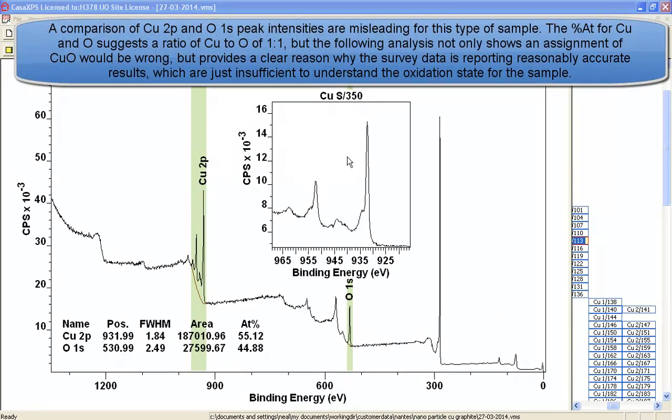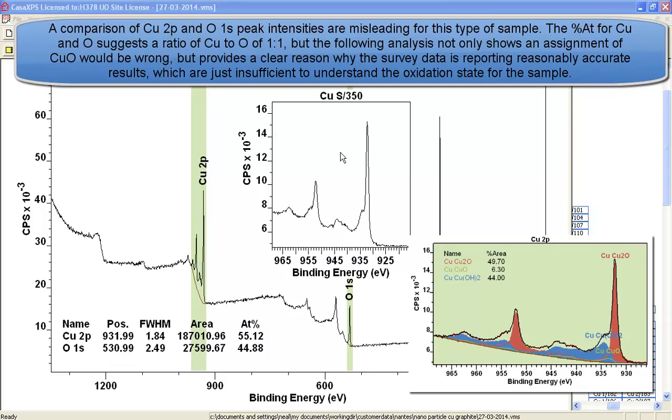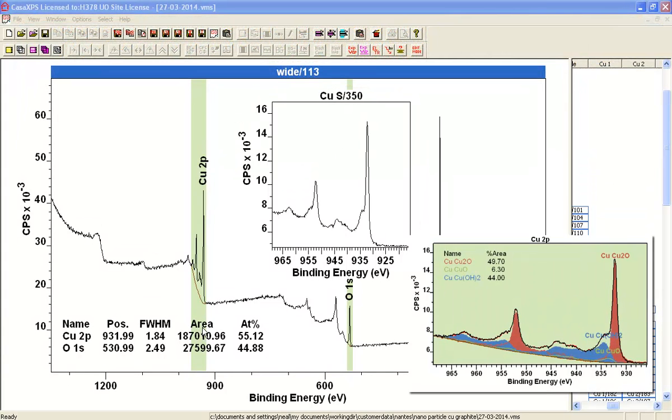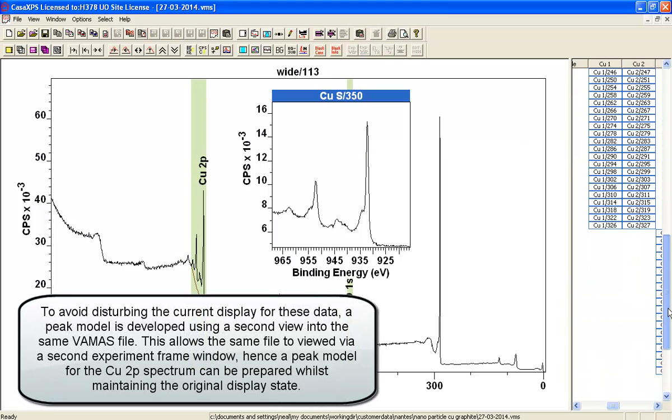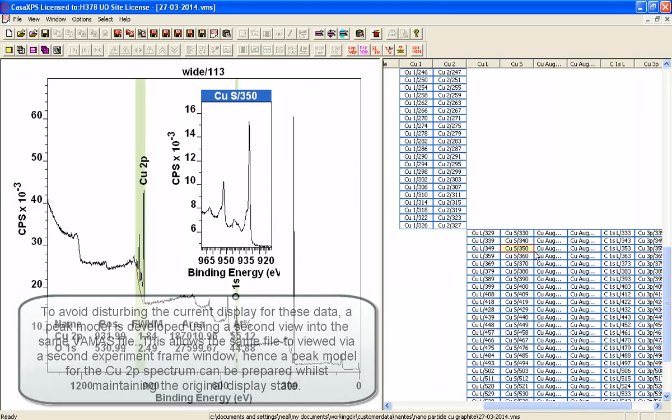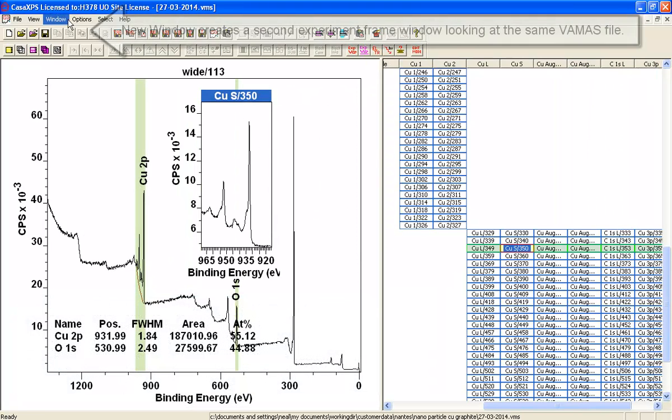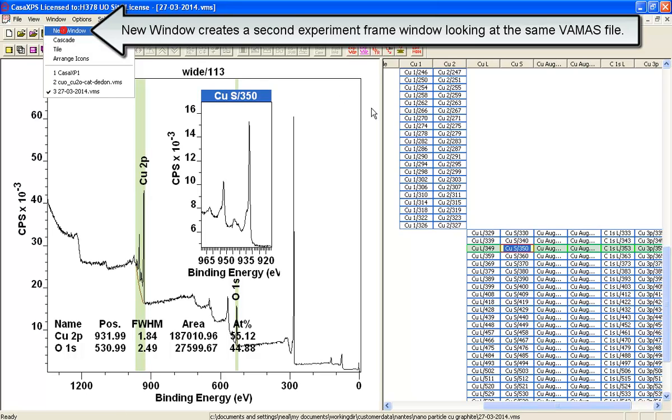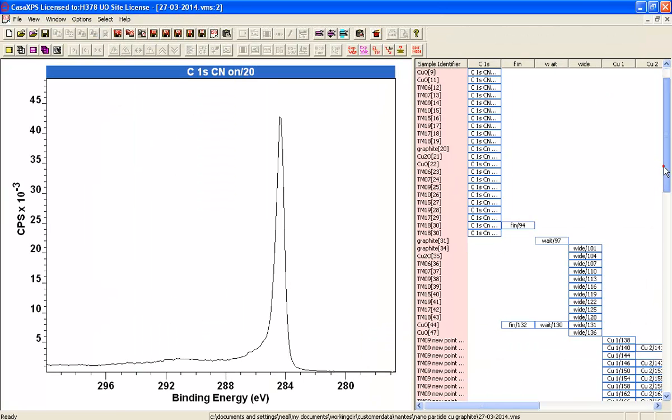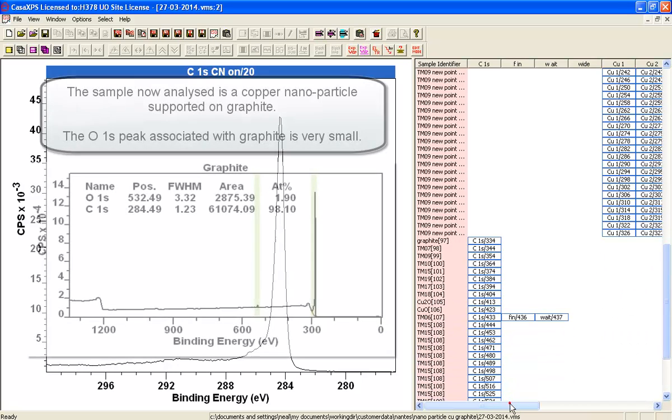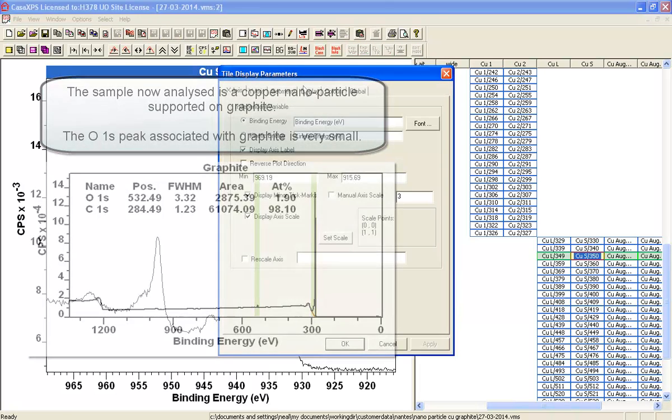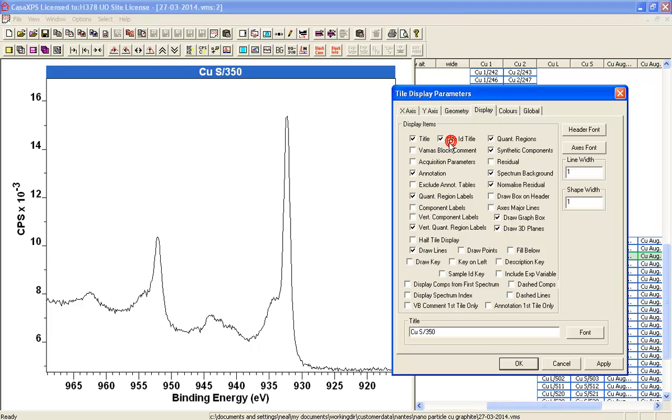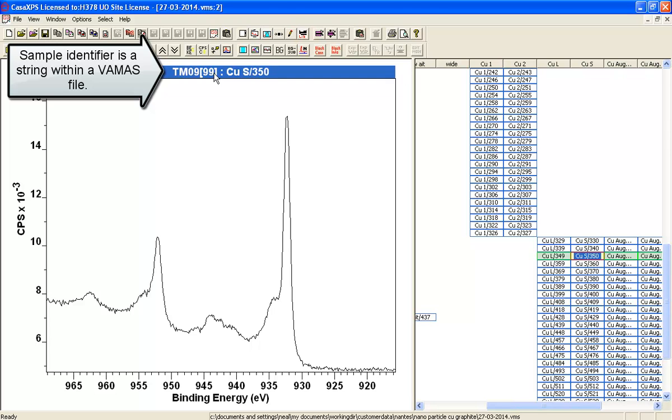We need to do some further analysis of this high-resolution spectrum to try and understand what the actual oxidation state is for these data. So let me just click on that, and let's find the VAMAS block. There it is. So what I want to do is do a bit of processing here. Let me just verify that I've got the same one, so I'll put up the use ID tag. That'll put the sample identifier in with the header, so we can see that it is the same one.